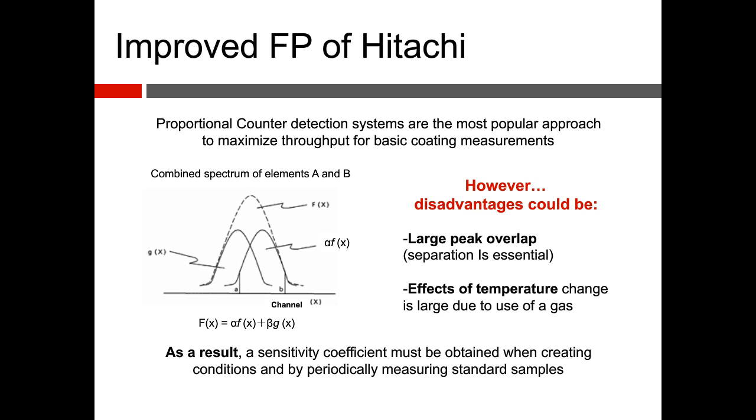As a result, sensitivity coefficient needs to be obtained when you're creating these conditions, and in the empirical method, you'd use reference materials to get that tight.